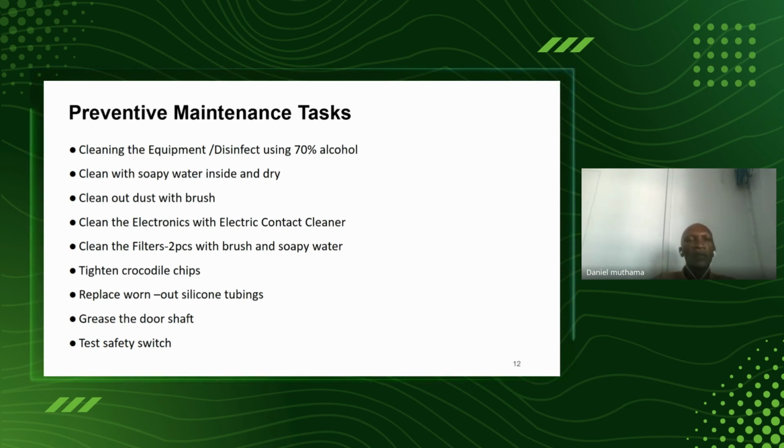Tighten the crocodile clips. We design these crocodile clips. This is clips, not chips. Sorry for that. Crocodile clips. So sometimes these crocodile clips get loose, so we request them to tighten them.